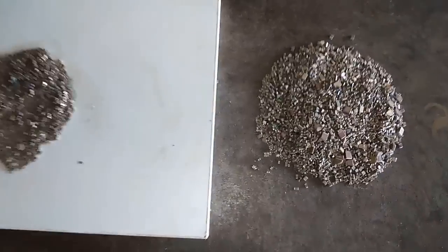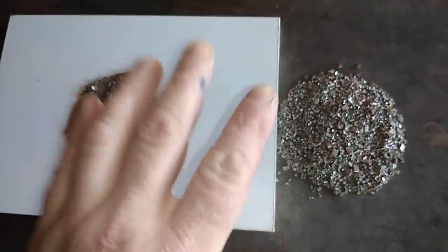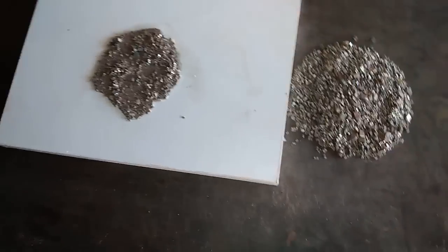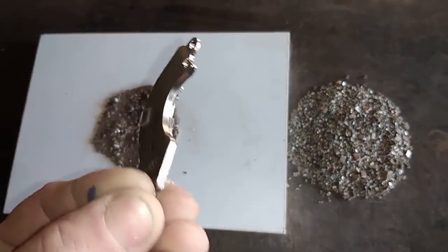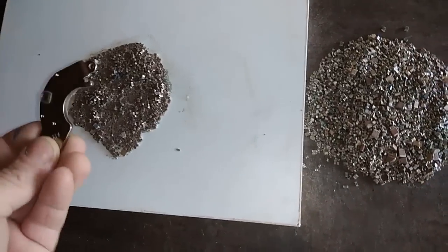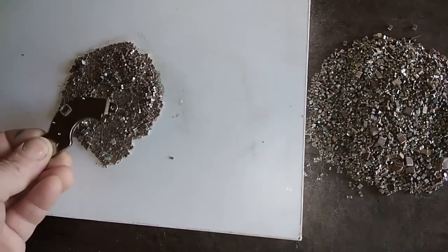For the first step, I got around 400 grams of MLCCs. I already separated them with the new neodymium magnet - it's very strong. On this pile we have non-magnetic ones.